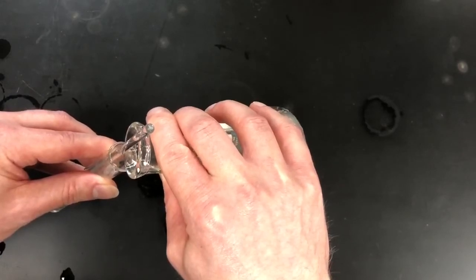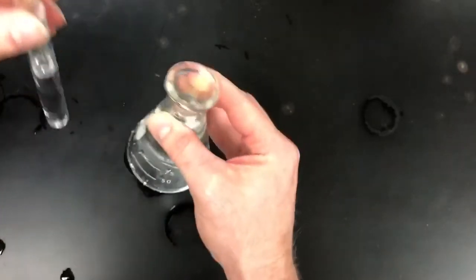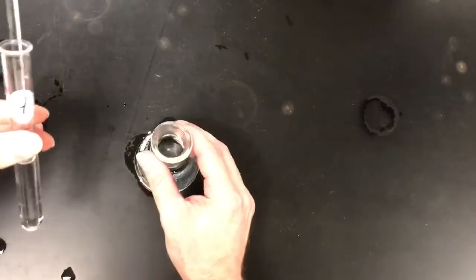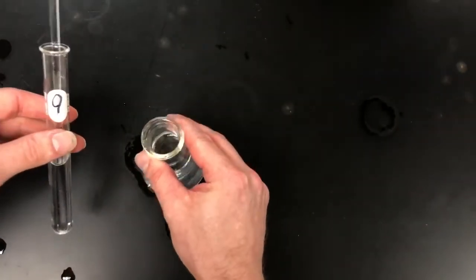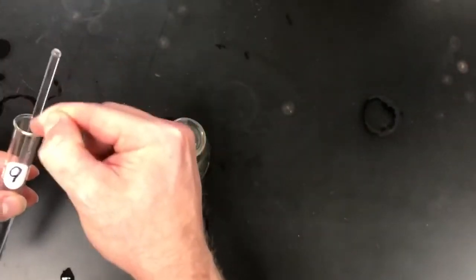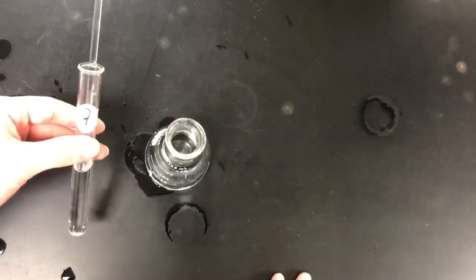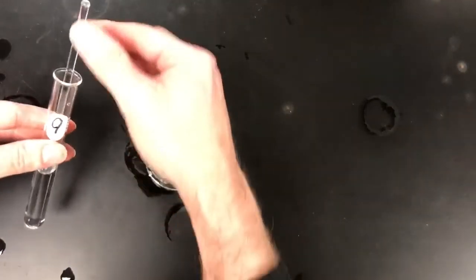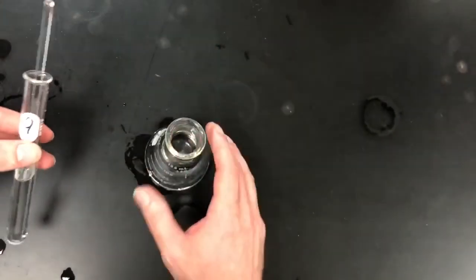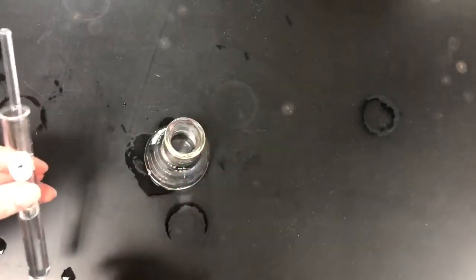Answer the questions on the data sheet, then clean the area and put away the equipment. The reason we use a stirring rod when pouring from the Erlenmeyer flask to the test tube is so it has more of an even flow and the liquid has something to go against. Usually when dealing with acids and more harmful chemicals, this is the procedure we use. It should be easier to pour with the stirring rod.